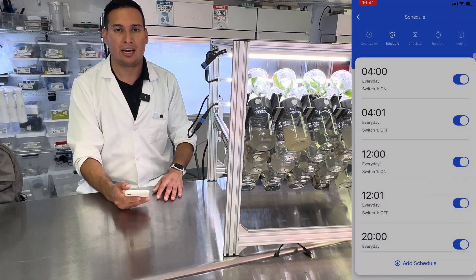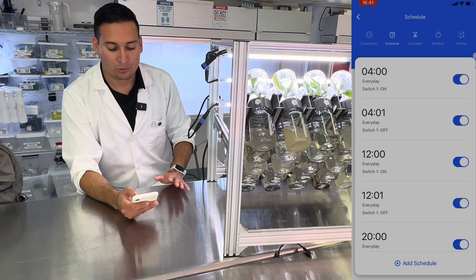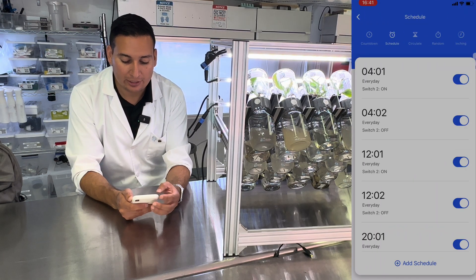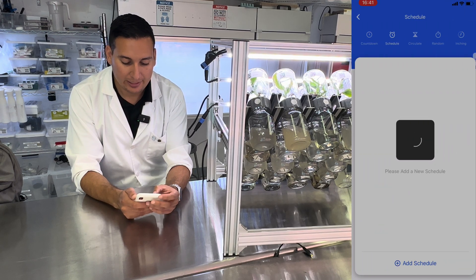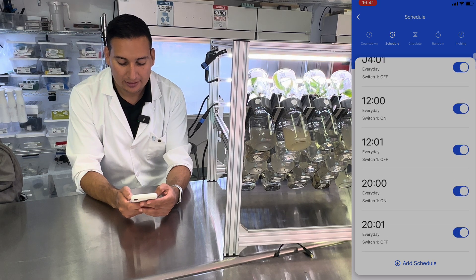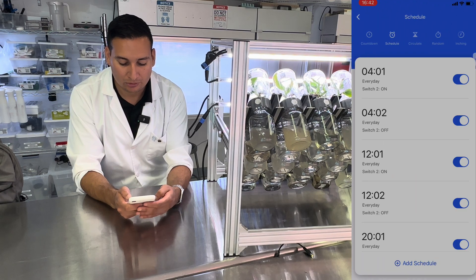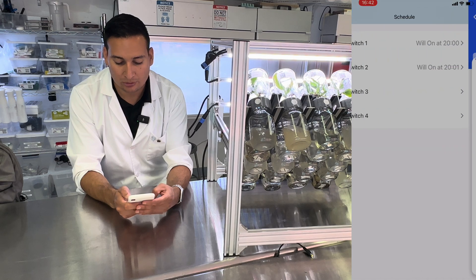This is an example of how it would look if you wanted to flip every 8 hours. Switch number one will turn on at 4 in the morning, then turn off at 4:01. Switch number two will turn on at 4:01 and turn off at 4:02. Then switch number two will turn on at 12:01 and turn off at 12:02.